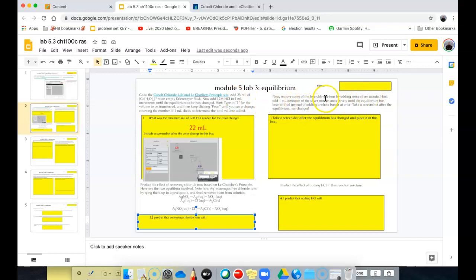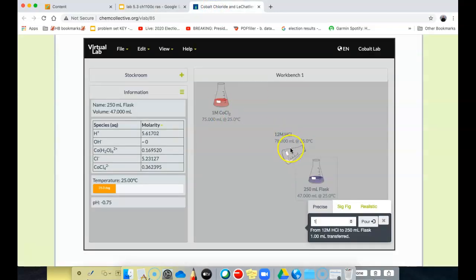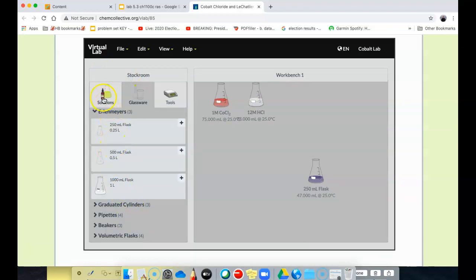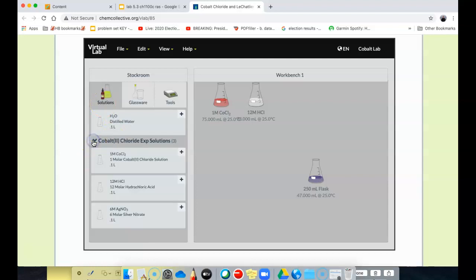Now we want to get rid of some of those by adding silver nitrate. So the reaction must be that those chloride ions react with silver cation to make silver chloride precipitate. That does get rid of them from the solution. So it says add 1 ml of the silver nitrate successively until the equilibrium has been shifted, instead of adding a whole bunch at once. So 1 ml each. So let's go here. I'll bet they have some silver nitrate solutions, don't they? There it is.